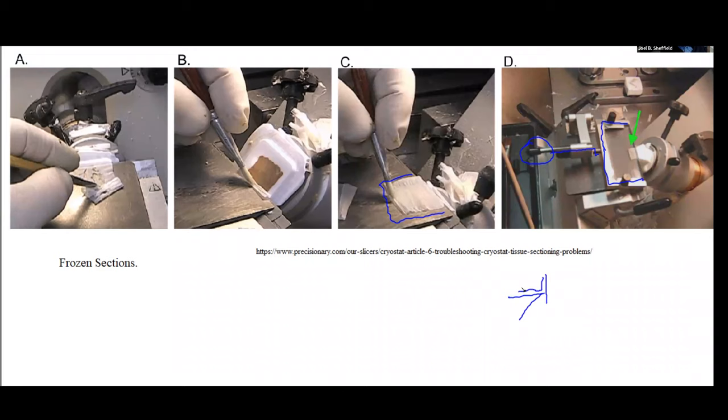In the absence of anything else, this section would curl up, as you see it in this picture here. What's here instead, then, is this piece of plastic that actually is supported just over the section, like this, and the section goes between the knife blade and this piece of plastic. The plastic is referred to as an anti-roll bar.